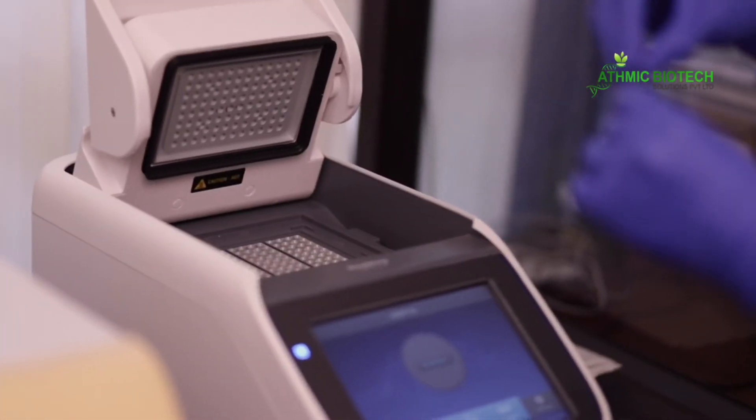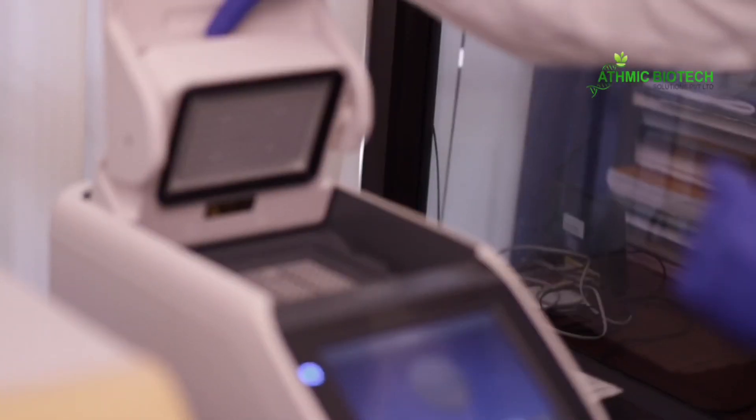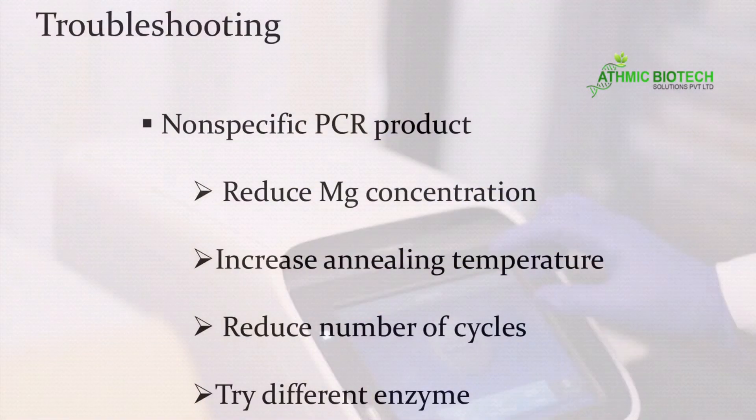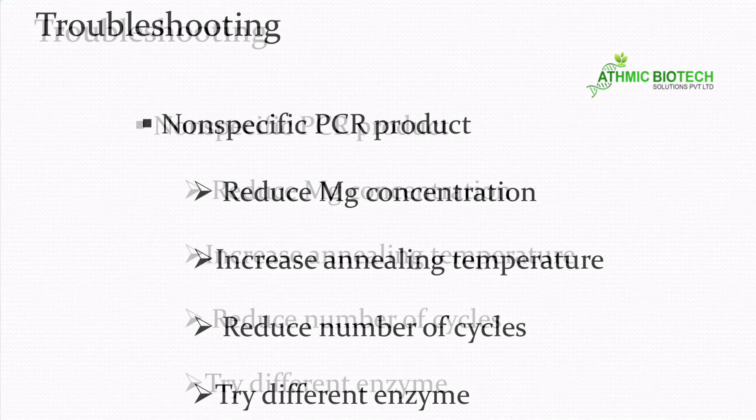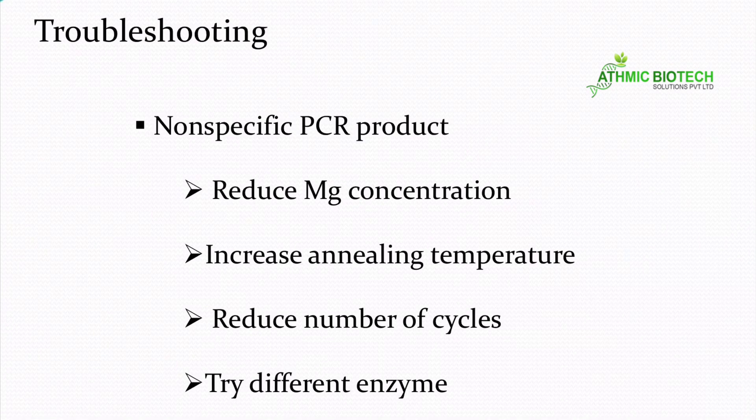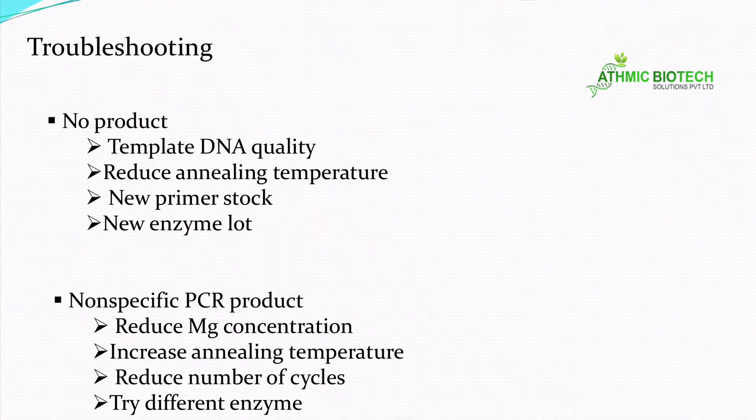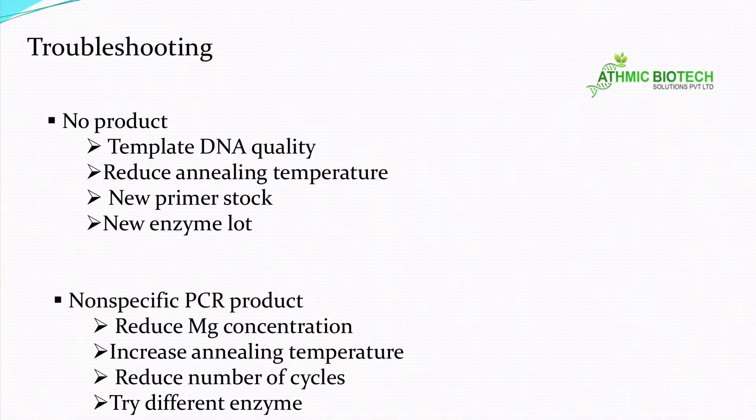Sometimes you are trying to amplify a 1 kb gene from an organism. Instead of 1 kb you got some band around 500 or 750. That is called non-specific PCR product. In such case you have to reduce the magnesium ion concentration and increase the annealing temperature. In the previous case if there is no product you have to reduce the annealing temperature. Here you have to increase if you got a non-specific PCR product. And third, you have to reduce the number of cycles and try with a new enzyme lot.